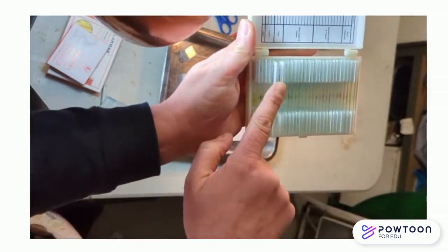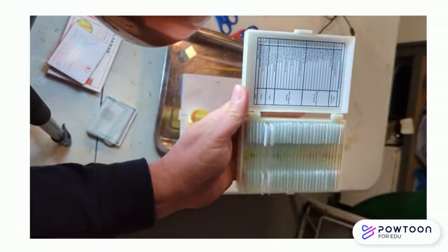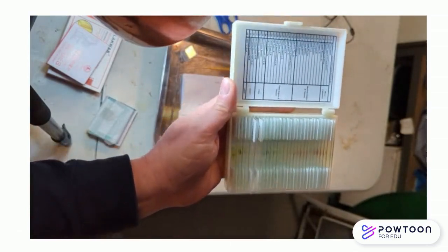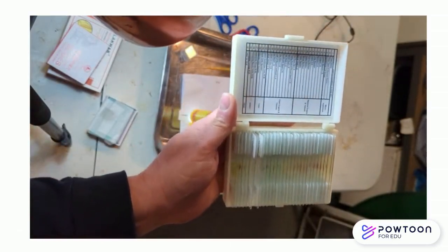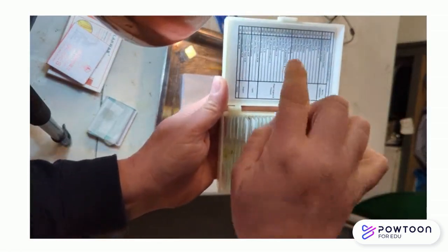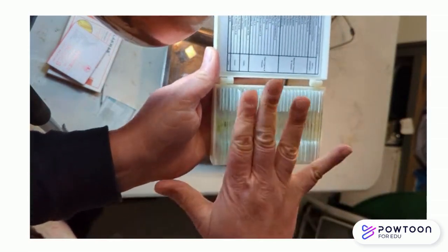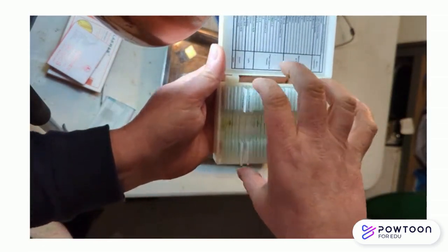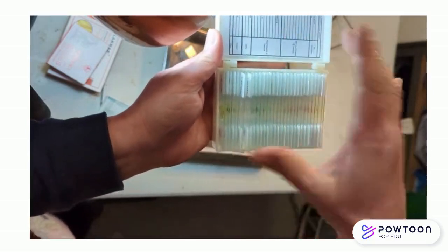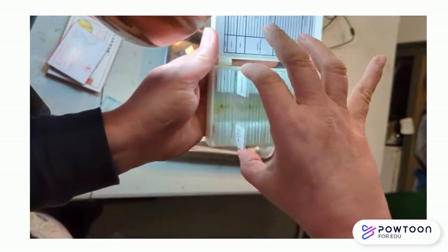Another important thing, and this is what I always say, is to start with the same things that the seniors do. So if the seniors are choosing to check the cells in an onion peel, we have got this too, and it's number 24. Now, I sometimes find, when the whole set is ready, pulling out slides a bit difficult. So if you can, pull the one before, pull the one after, and gently pull yourself one.